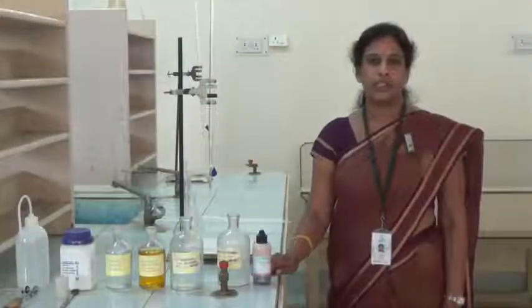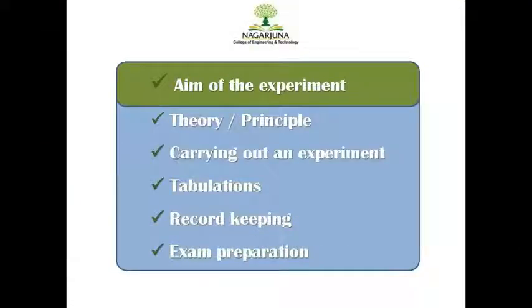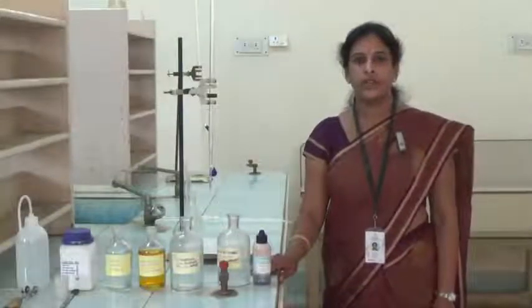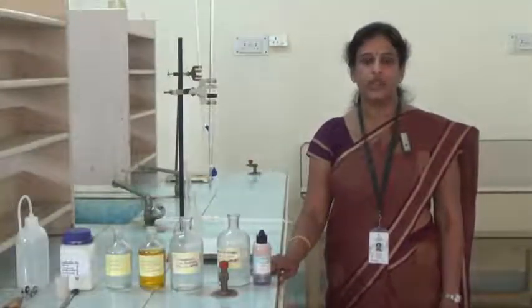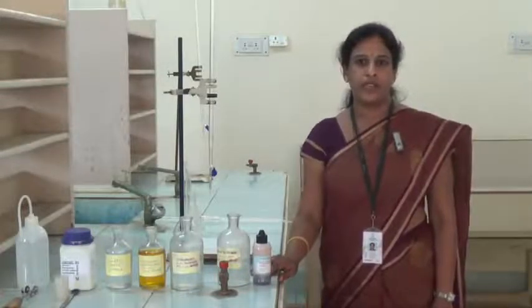Name of the experiment is COD of industrial wastewater. Aim of the experiment is determination of COD of industrial wastewater using standard FAS solution, ferrous ammonium sulphate solution.